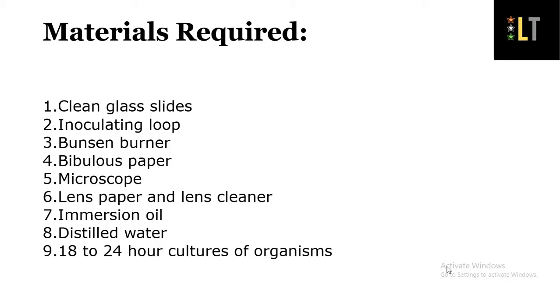Bibulous paper is the same as tissue paper or filter paper, and it is used to remove the excess water or stain on the glass slide. Microscope, lens paper and lens cleaner. The lens cleaner is used to clean your objective as well as eyepiece lens. Immersion oil. In case of immersion oil, you can use either white paraffin liquid or cedarwood oil. Distilled water to clean or wash the slides, and 18 to 24-hour cultures of organisms.